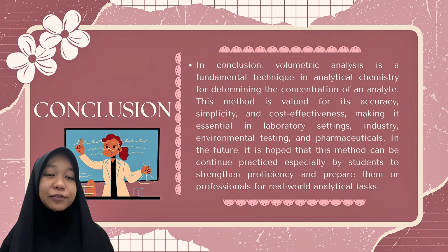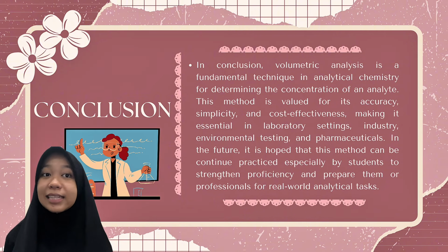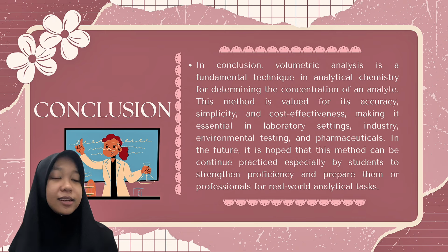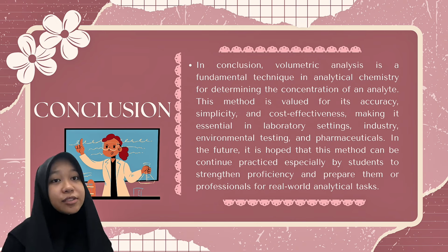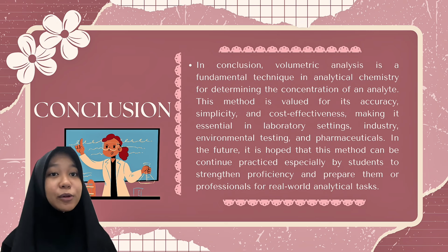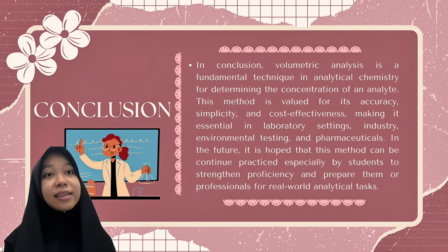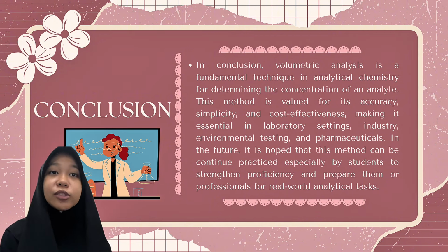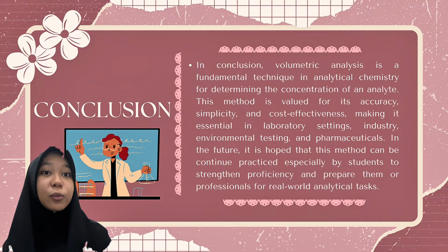In conclusion, volumetric analysis is a fundamental technique used in analytical chemistry. This method is valued for its accuracy, simplicity, and cost-effectiveness, making it essential in laboratory settings, industry, environmental settings, and also pharmaceuticals. In the future, it is hoped that this method can continue to be practiced, especially by students, to strengthen proficiency and prepare them for professional or real-world tasks.